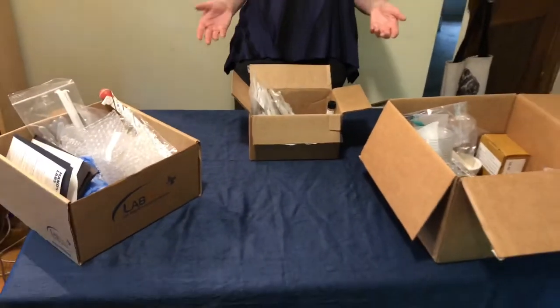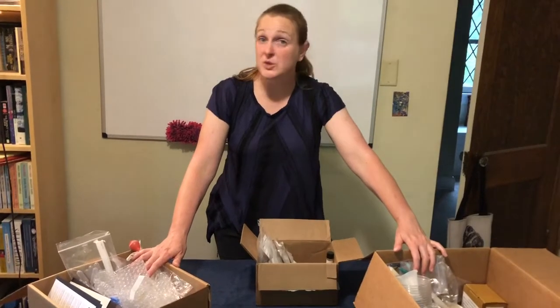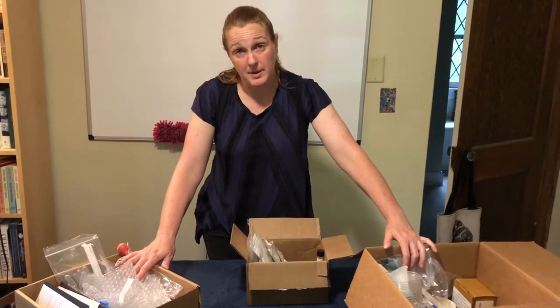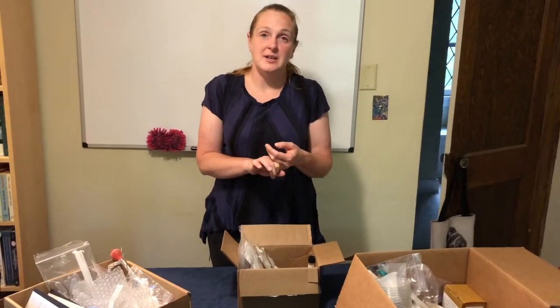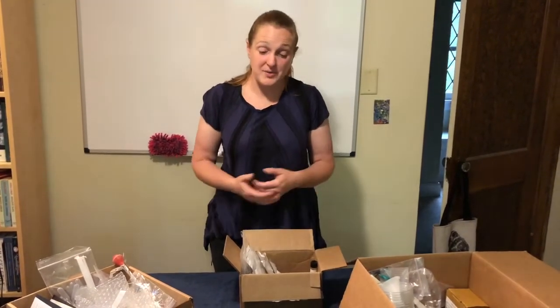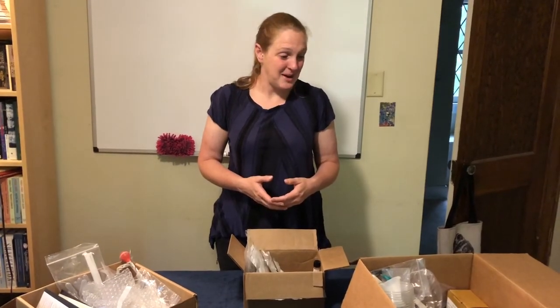I'm keeping all of these together in a smaller box to stay really organized. I'm also including my iodine indicator bottles — we have two, one of three milliliters and one of seven milliliters — as well as a little bottle of detergent and a little bottle of agar. What I'm going to do every weekend is set aside the supplies I'll be using for the upcoming lab, make sure I've got everything, and read through my protocols. I'll set a day to conduct the lab, and during that time I'll do the pre-quiz called Exploration, do the experiment itself, answer the questions, and finally complete the Evaluation quiz. If you have any questions, please reach out through email or the Zoom office hours on Wednesdays from 11 to noon. This should be a lot of fun — I'm getting pretty excited!